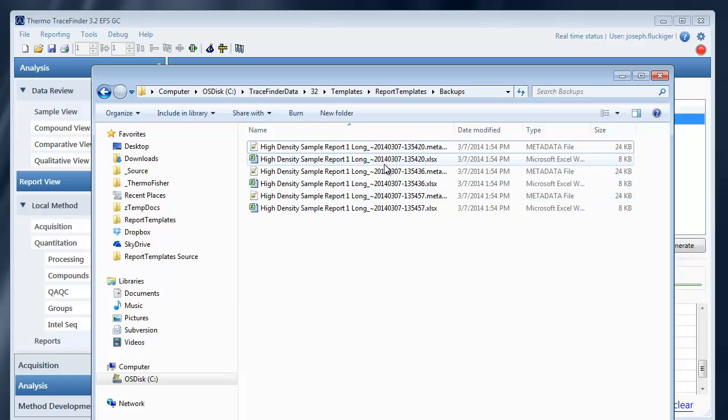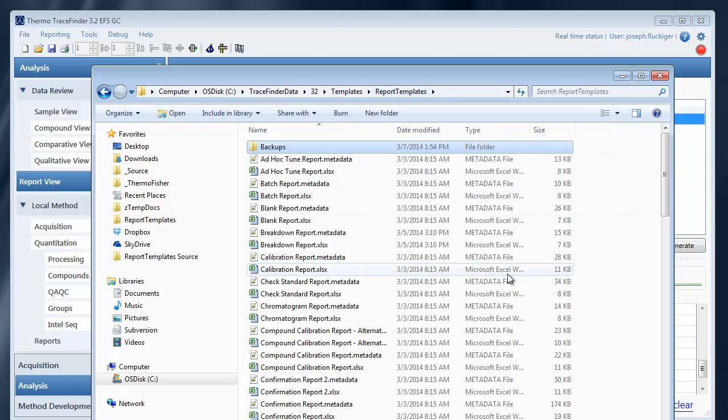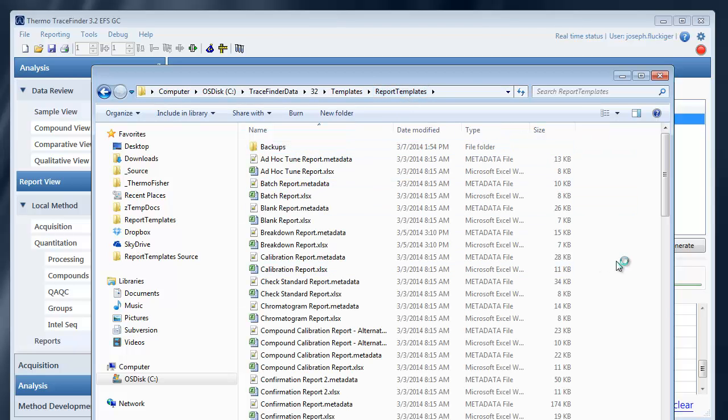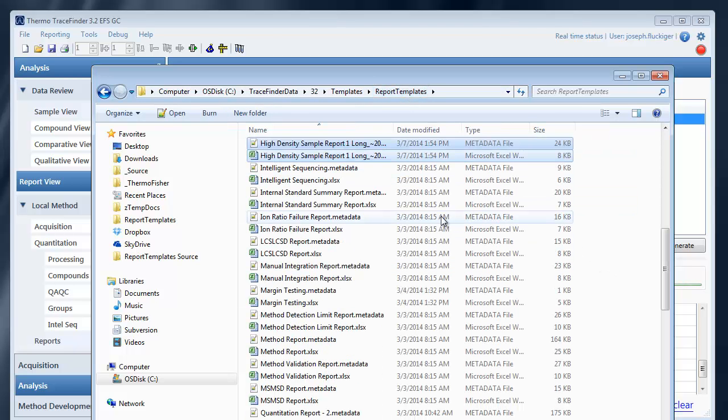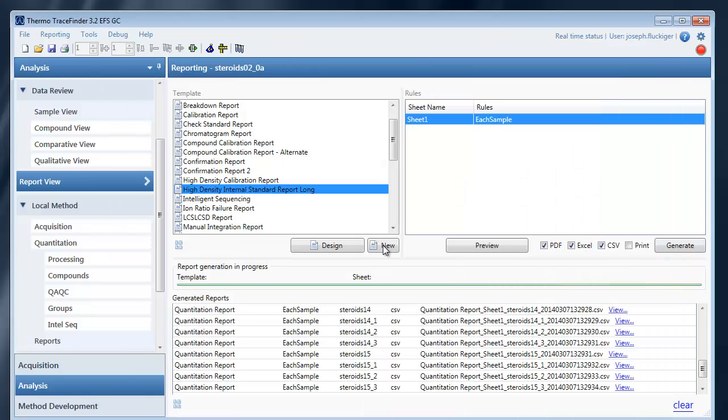If you want to restore a template you can manually move it from the backups folder back into the report templates folder. And that will cause it to show up here.